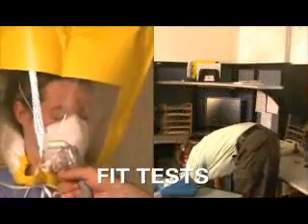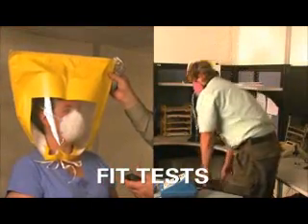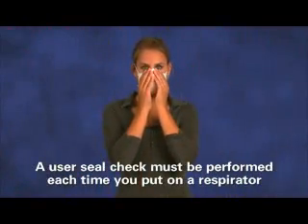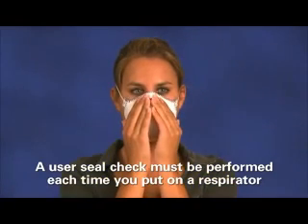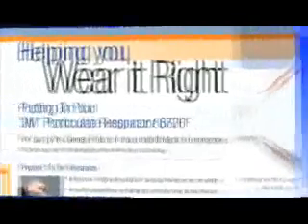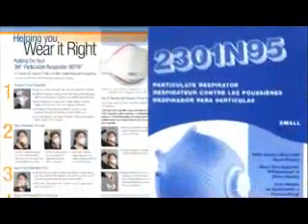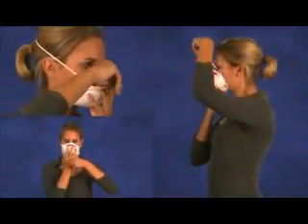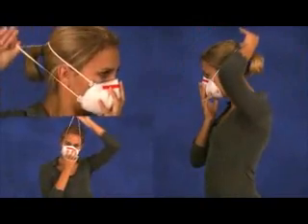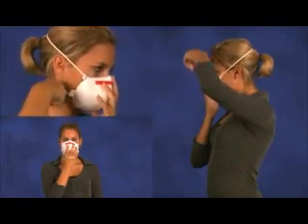A fit test must be performed before you wear a respirator for the first time and at least annually thereafter. A user seal check must be performed each time you put on a respirator to check that it has been donned correctly. Remember, always follow the respirator manufacturer's instructions for the specific respirator model that you are using. Here are some general instructions for properly donning and doffing and properly conducting a user seal check for the two most common types of respirators.